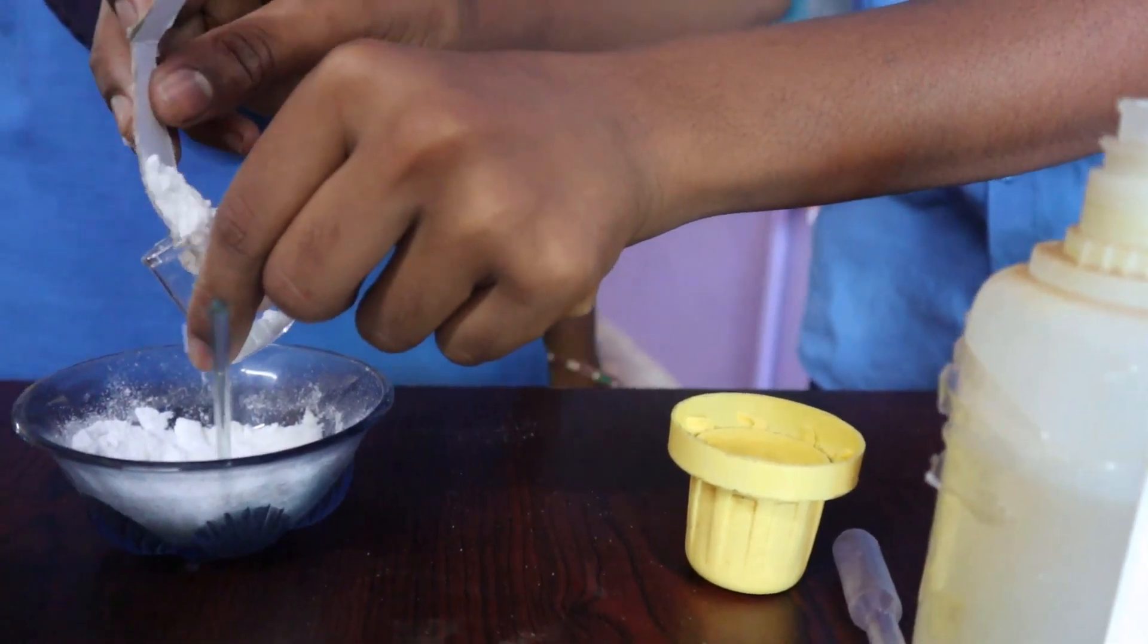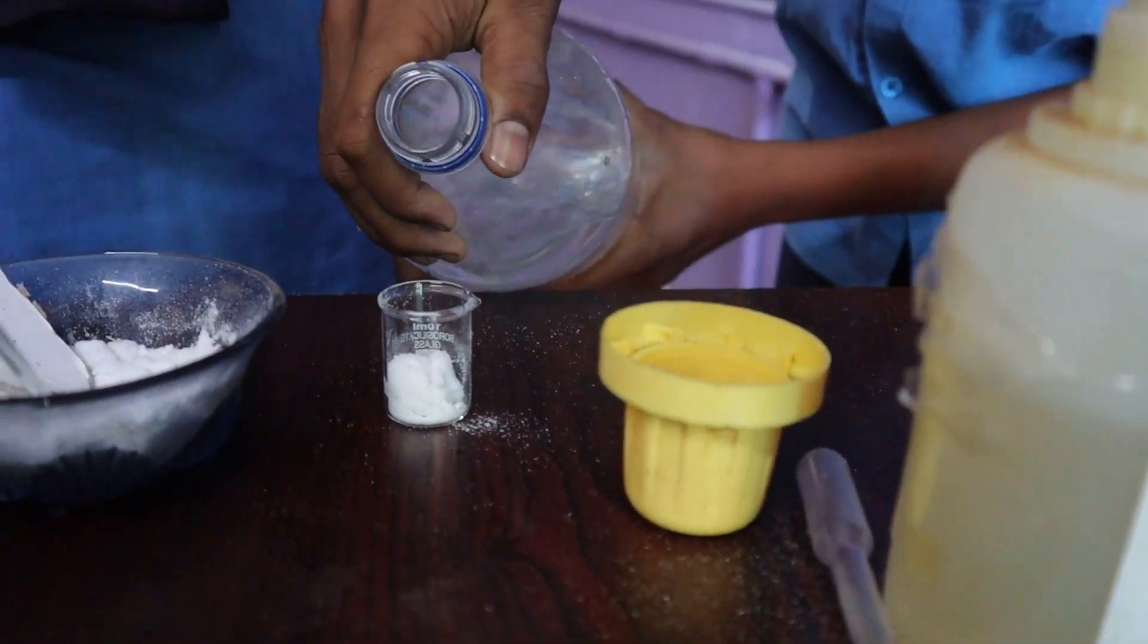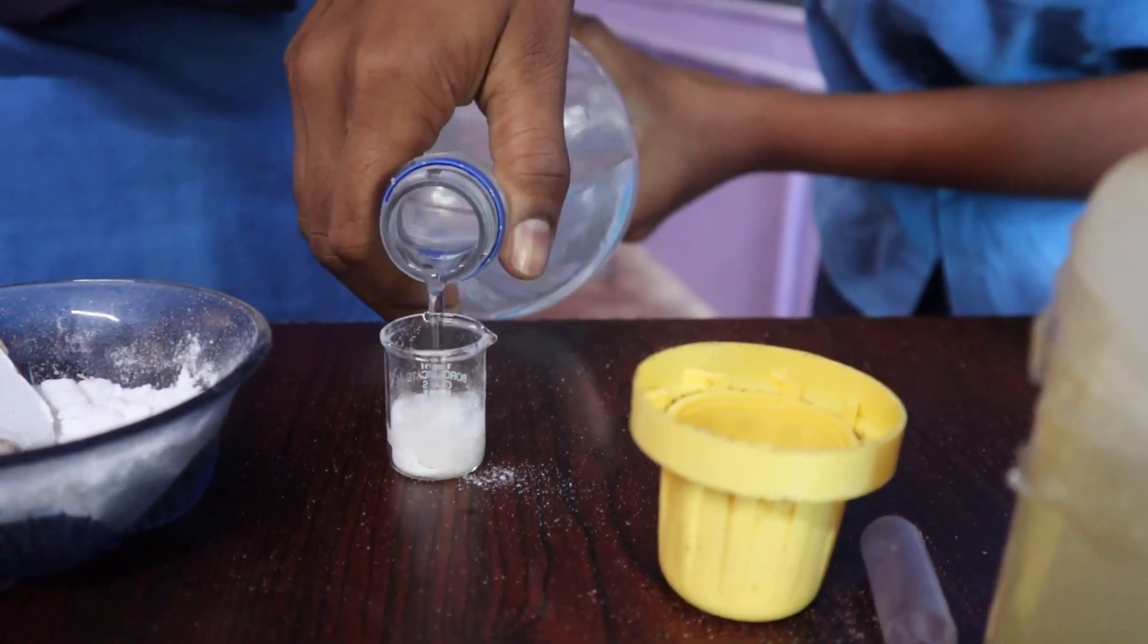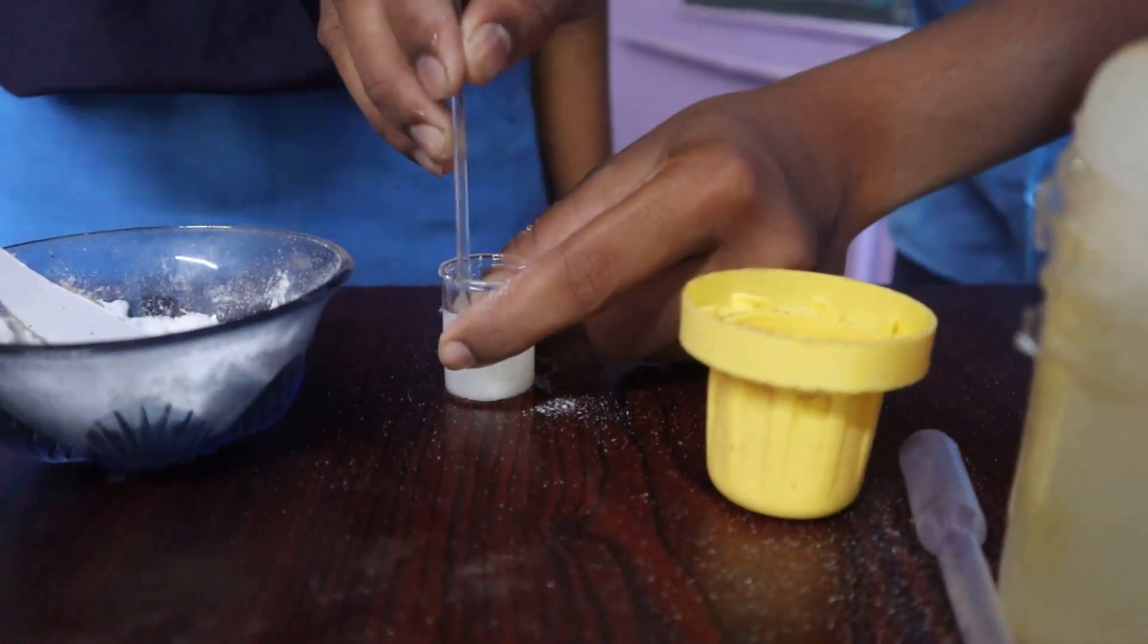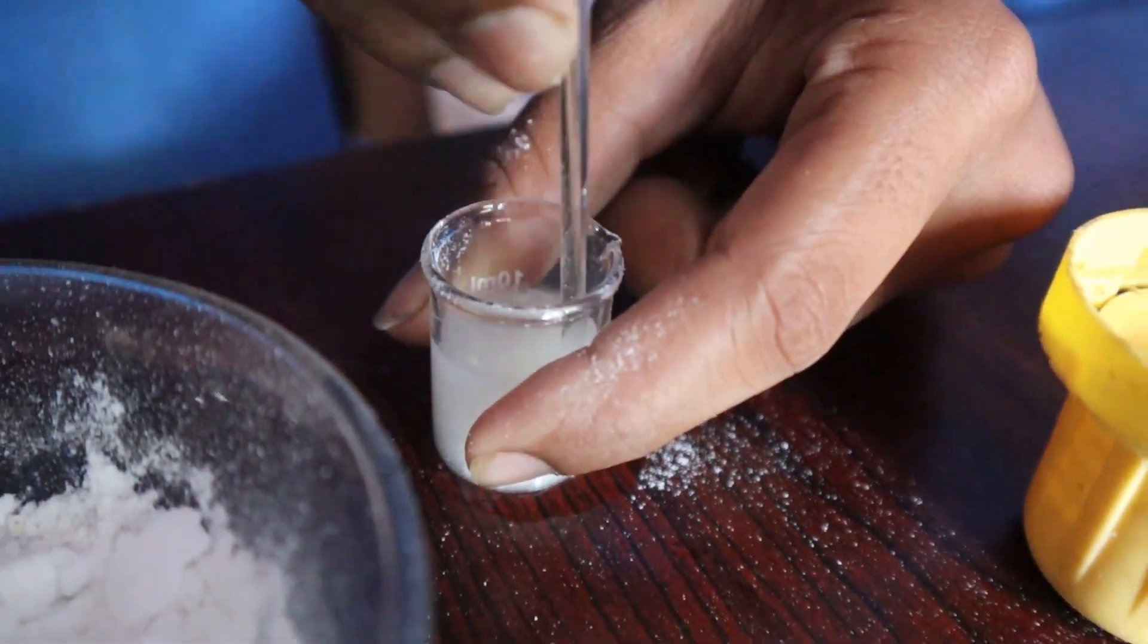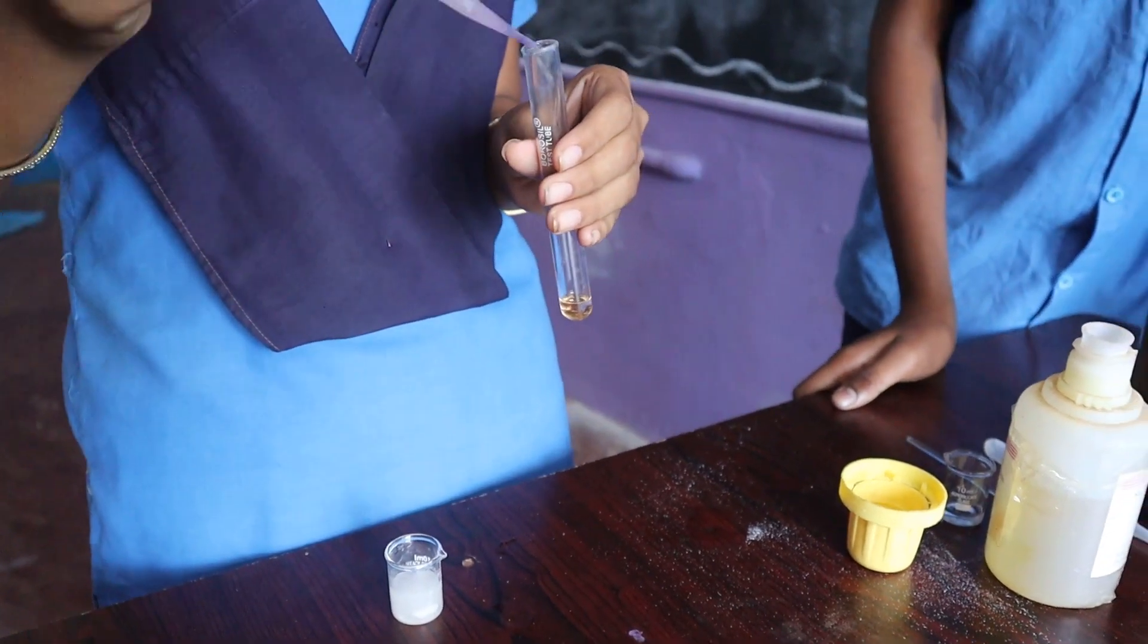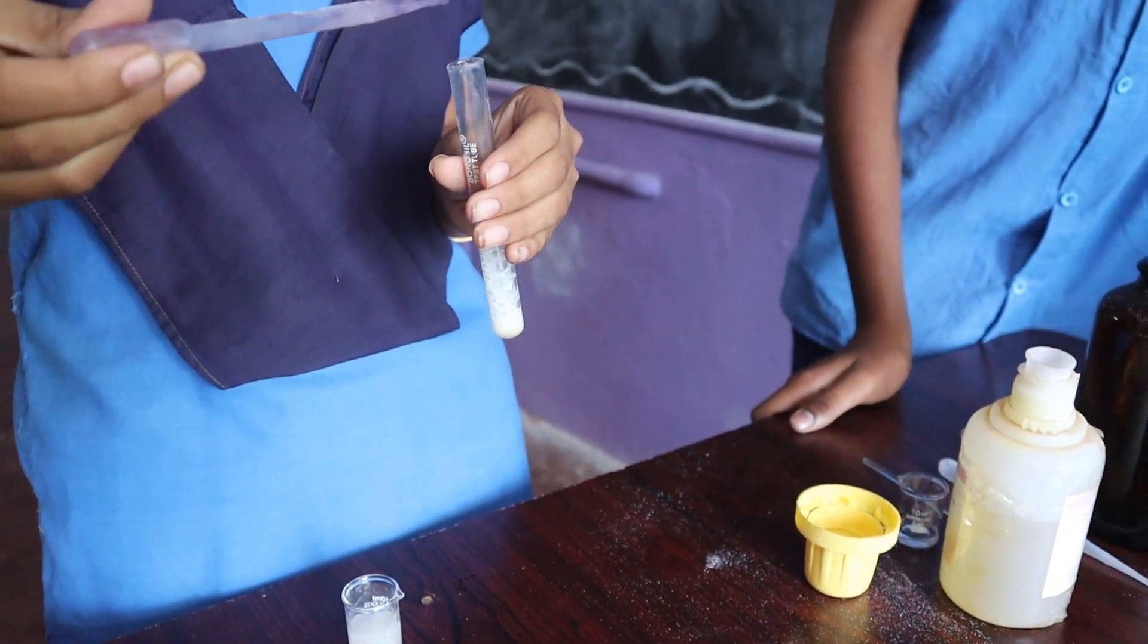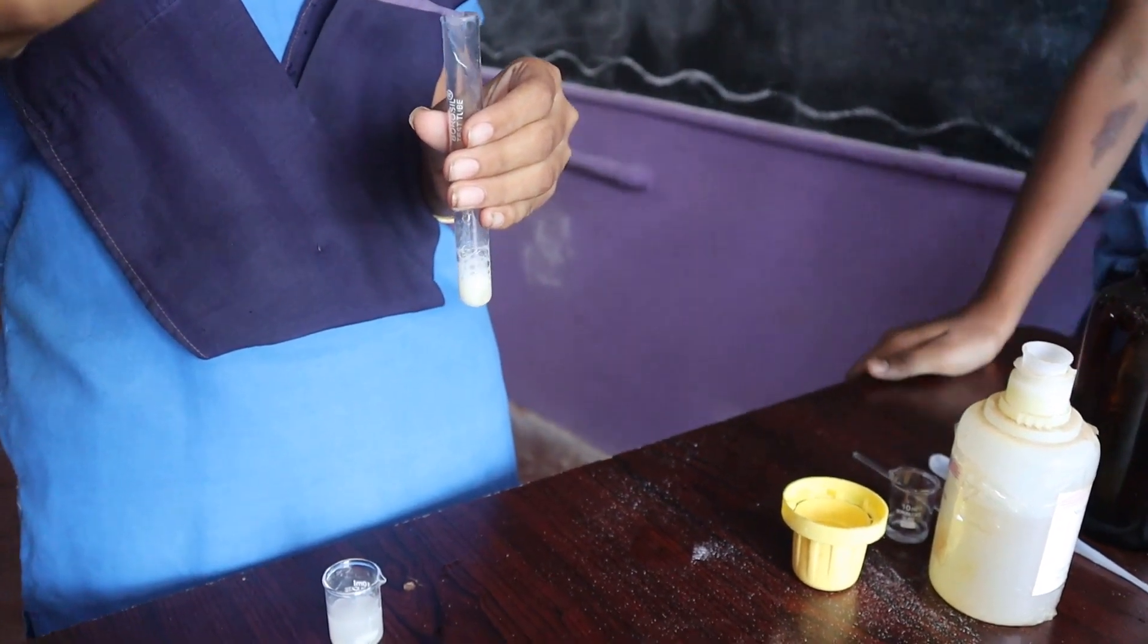Prepare baking soda solution in a small beaker. Add baking soda solution to hydrochloric acid solution dropwise and observe the color.